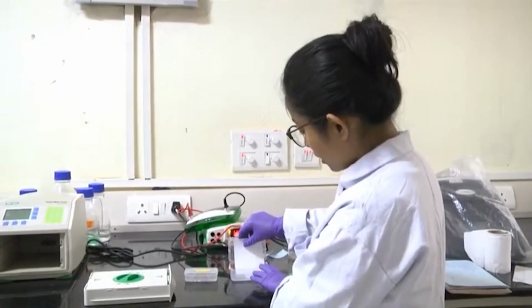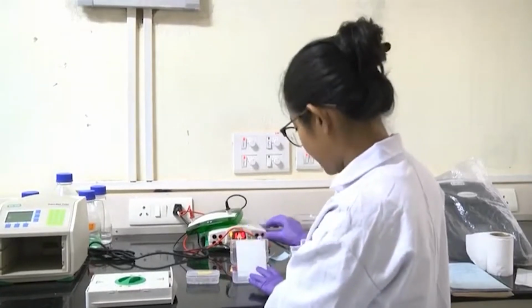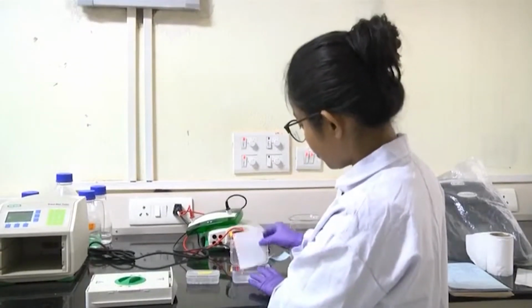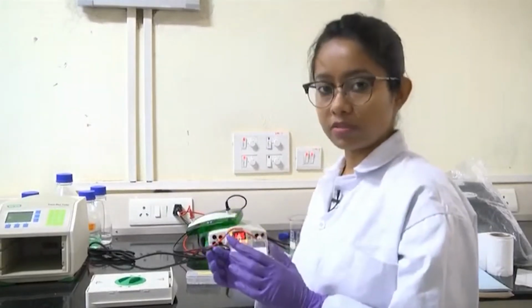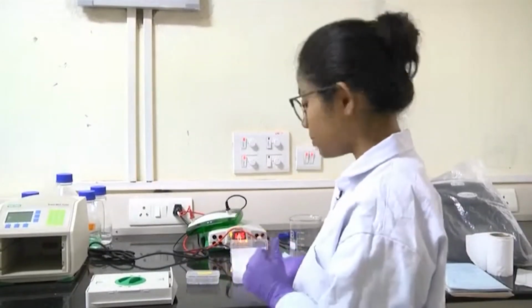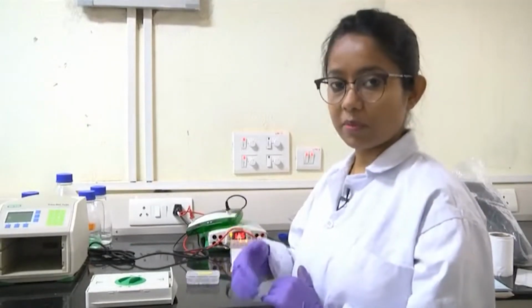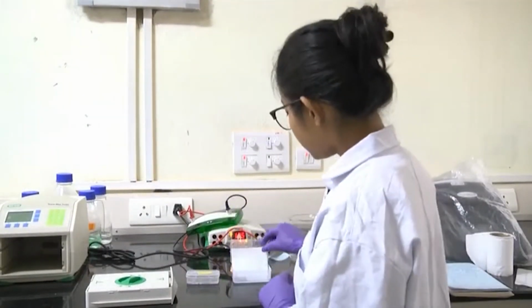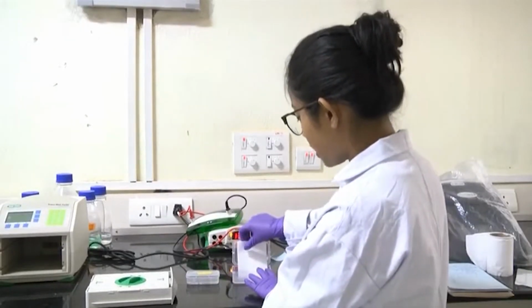There are two ways you can do the transfer, either a fully wet technique or a semi dry technique. In the wet technique you have to use sponges soaked with the transfer buffer, and in between there will be blotting paper, the membrane and the gel, and again blotting paper and another sponge. For today's demonstration we are going for semi dry transfer.